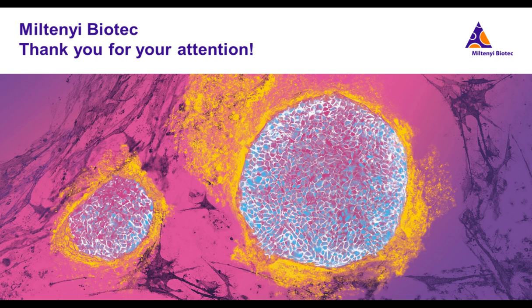Of course, I have to say that this is also dependent on the tissue you are using. Not every tissue will survive 400 antibodies or 200, but what I can say is that all the tissues we have checked so far are definitely able to survive more than 100 markers on this specimen. I'm curious to find out what exactly the limit is. Stay tuned, we will let you know where we think the limit is.